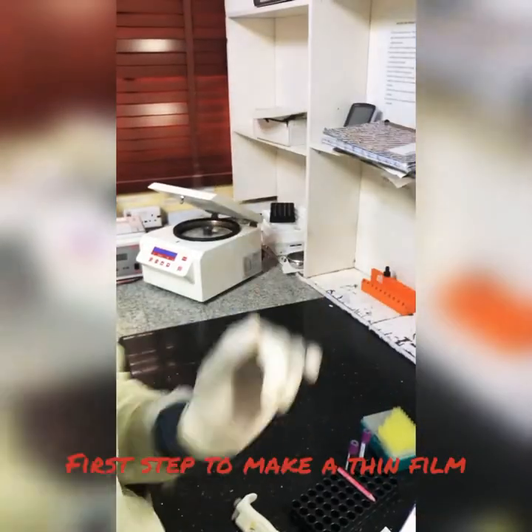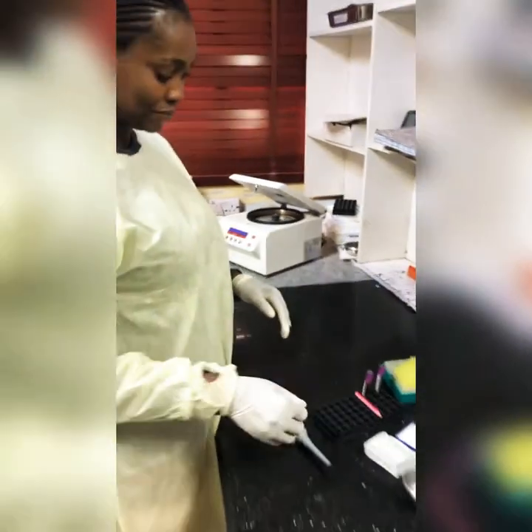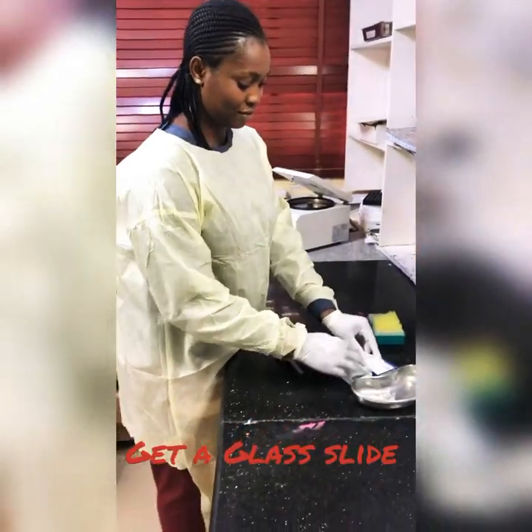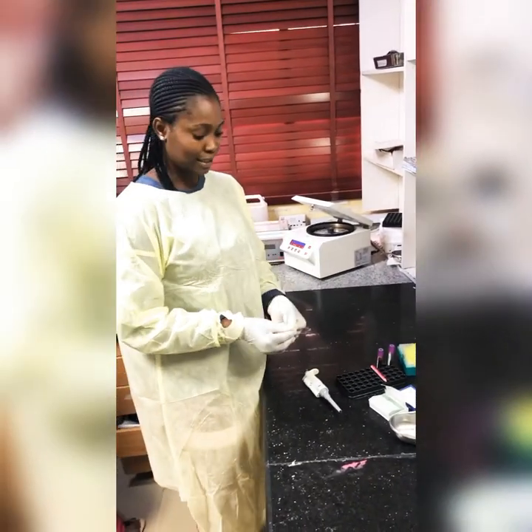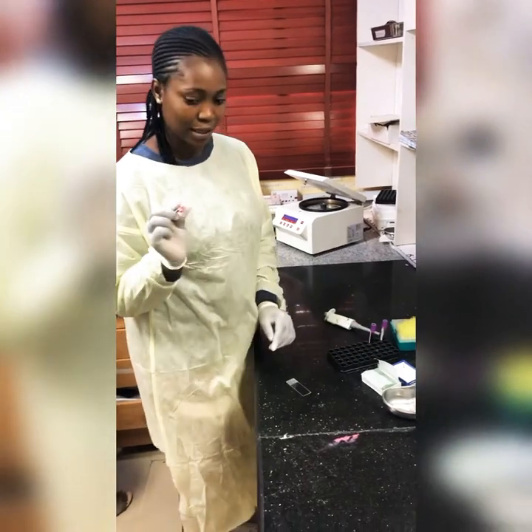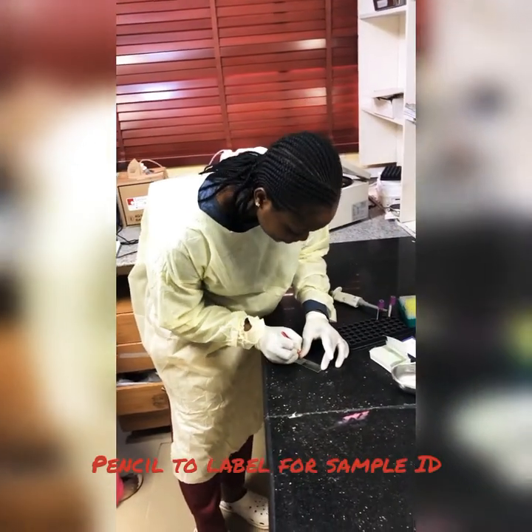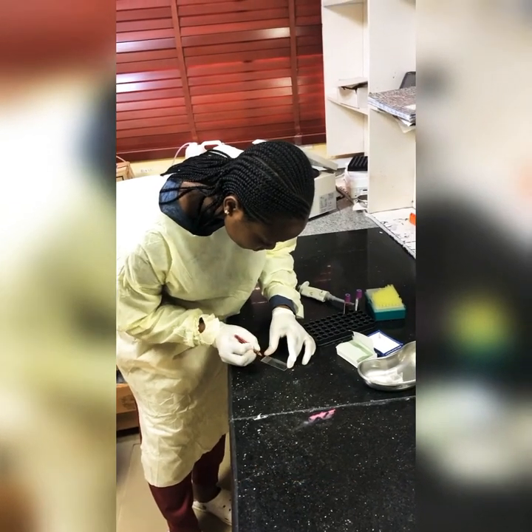Alright, stay tuned. So today, the process of making a thin film — after arranging the materials, the first step is you take a glass slide, which is what we use to make the film. Place it on a plane bench, on a flat surface.